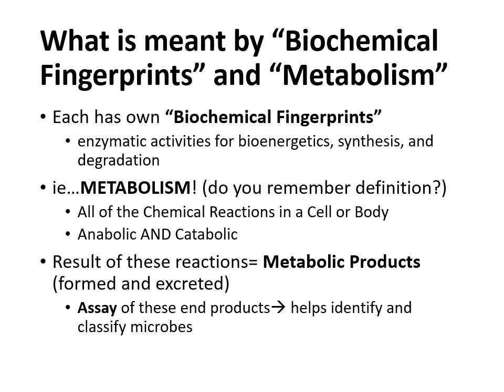Now, when we talk about identifying unknown bacteria, the main term that's going to keep coming up with that is biochemical fingerprinting. When you ask yourself how you're going to identify an unknown culture or unknown bacteria, well, a lot of the times we're able to do that based upon that microbe's enzymatic activities.